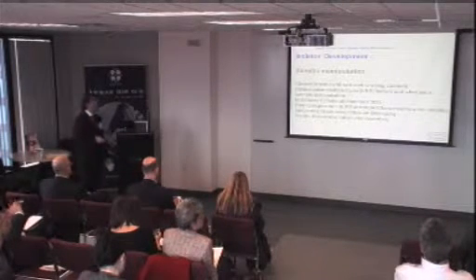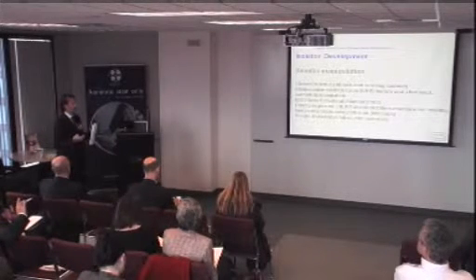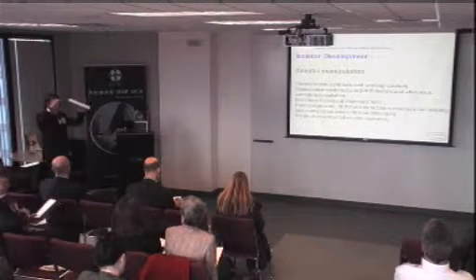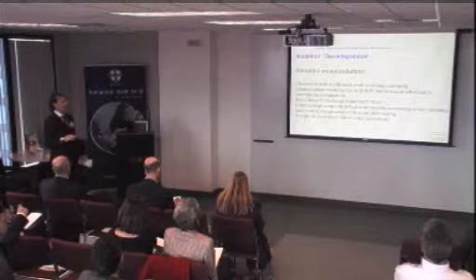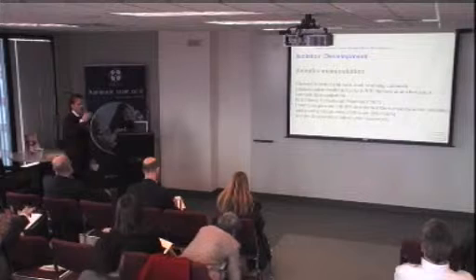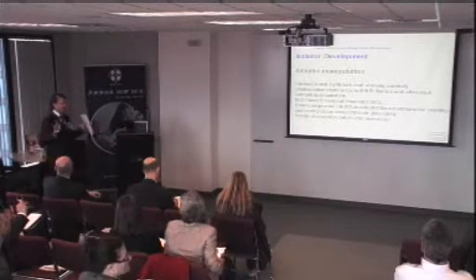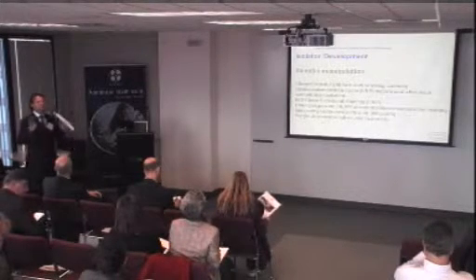And the important thing is that the air during the exposure of the sample is filtered through absolute filters, and there is a laminar airflow that maintains the purity and the sterility of the air by recirculating the volume of the cabinet more than 800 times per hour. Again, all the materials used to perform the manipulation are sterile and disposable.